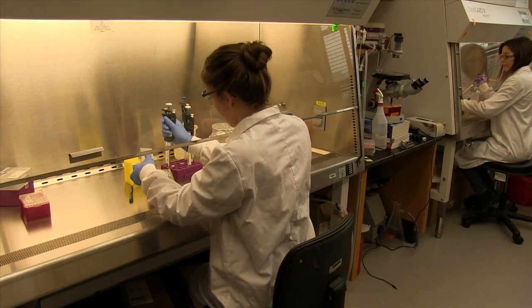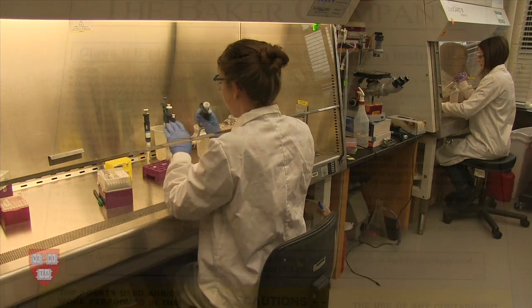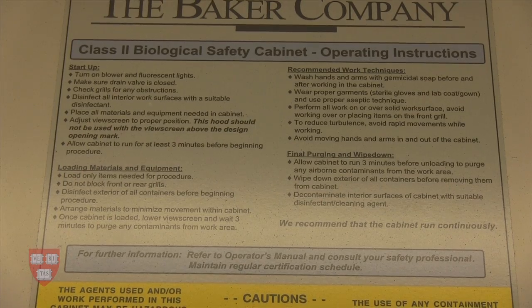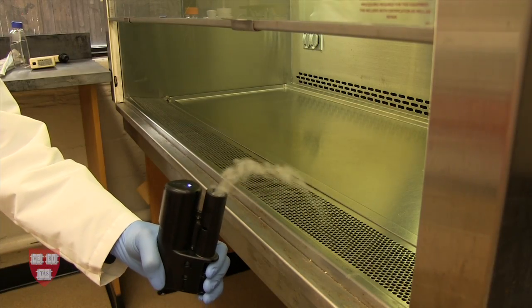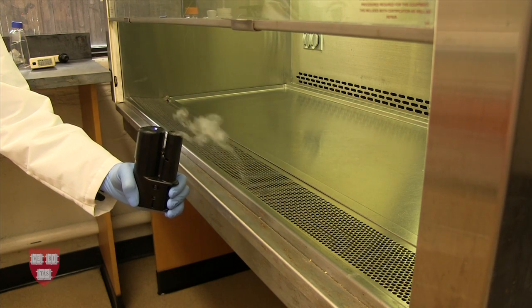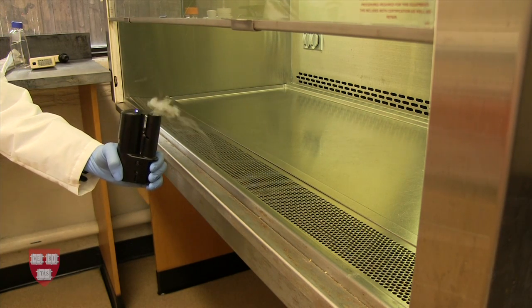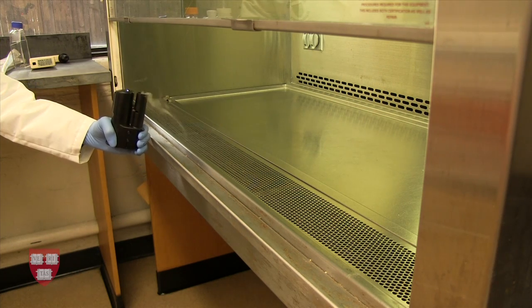Class 2 biosafety cabinets are the most commonly used engineering control in labs working with biological materials. A major advantage of working in these cabinets is that the working environment is protected from contamination by a constant downward flow of HEPA-filtered air. More importantly, a Class 2 BSC protects both the researcher and the surrounding area.